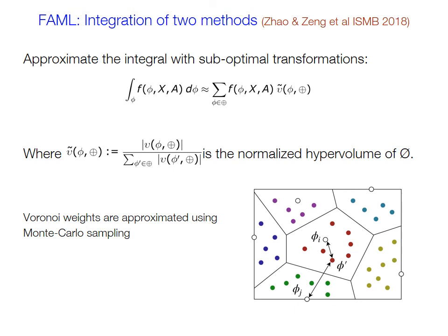The full integration is not computationally feasible, but with such an approximation, we can achieve a significant speedup compared to the existing maximum likelihood estimation method, and also achieve a significant quality improvement compared to our previously developed fast alignment method.